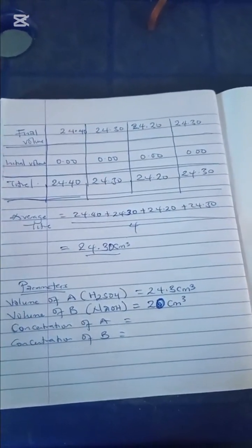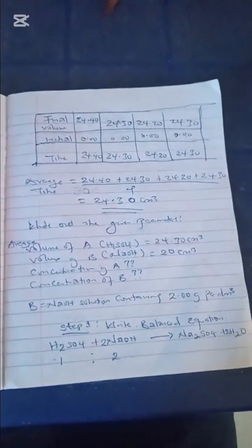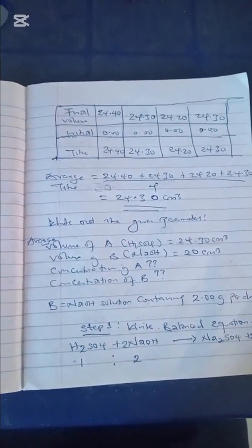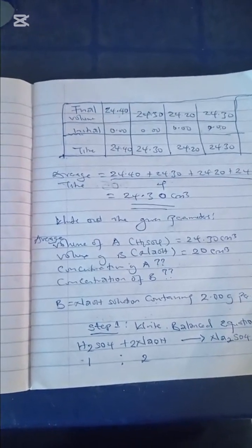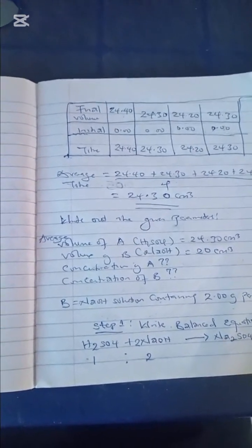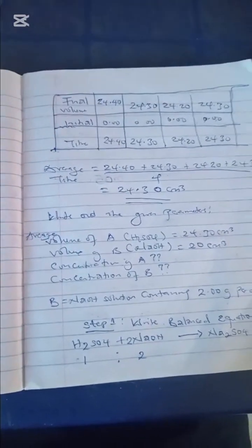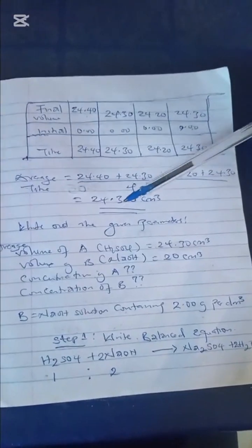Now we have gotten to this point, we'll go back to the question. What did the question say? The question said we should calculate the concentration of B, that's the sodium hydroxide, the pH of A, that's the tetraoxosulfate VI acid, and the amount of the SO4 ions that reacted. So look at the calculations we have made. We have gotten the average acid volume.